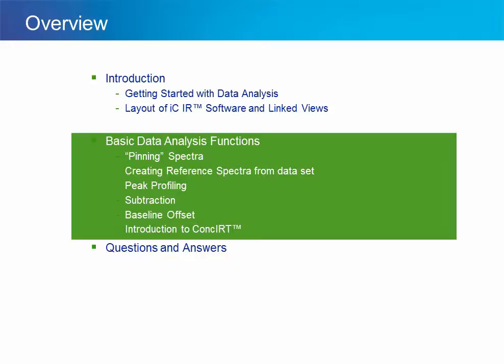Moving forward to the data analysis functions that we're going to cover. The first will be pinning spectra. We will then go through how to create reference spectra from a data set. We'll go through peak profiling. We'll go through subtraction, baseline offset, and a brief introduction to ConcIRT.